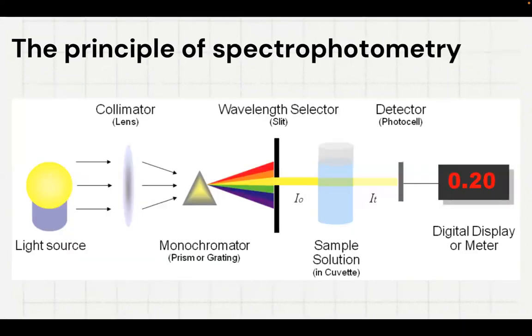As we want to explore the relationship between reaction time and enzyme efficiency by getting relevant data and plotting a graph, we use spectral photometry to measure lactase enzymatic activity under different conditions. In this lab, the underlying principle of the UV spectral photometer is that different substances absorb different wavelengths of light. One substance has its unique absorption spectrum.